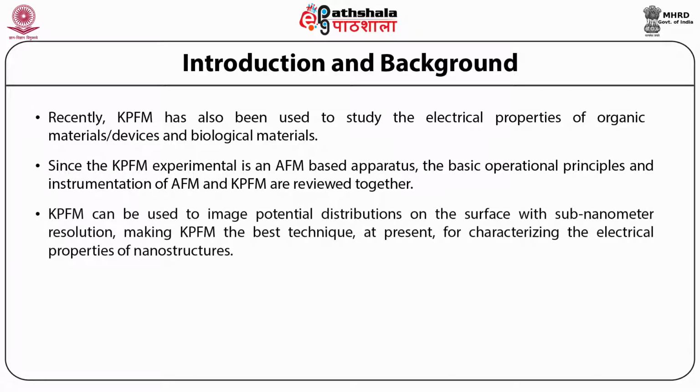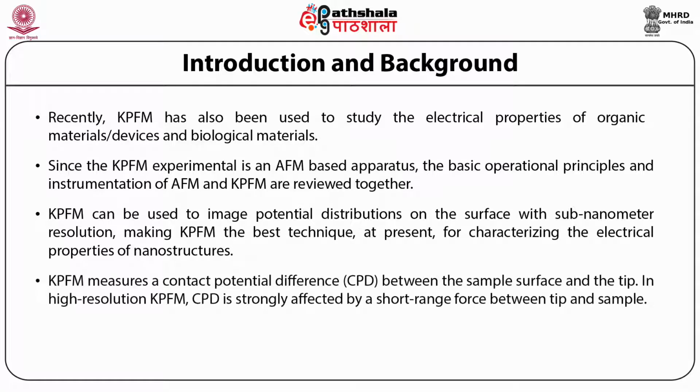KPFM can be used to image potential distribution on the surface with sub-nanometer resolution, making KPFM the best technique possible at present for characterizing the electrical properties of nanostructures. KPFM measures a contact potential difference between the sample surface and the tip.